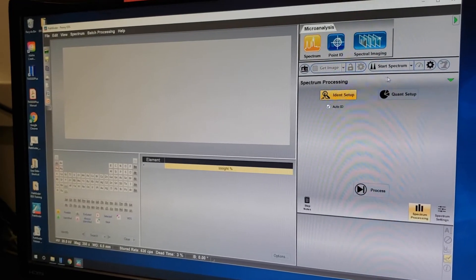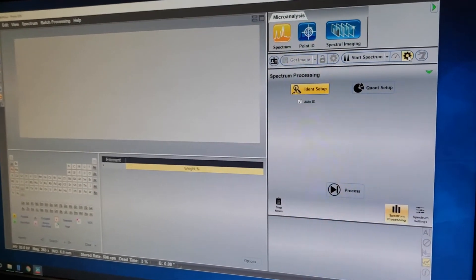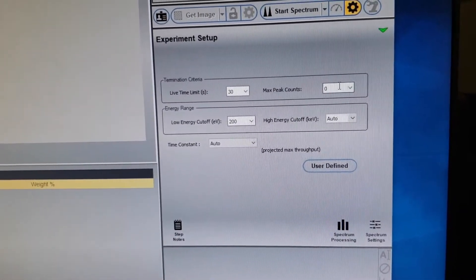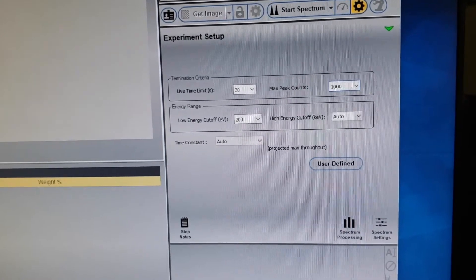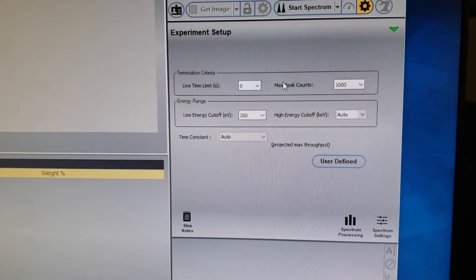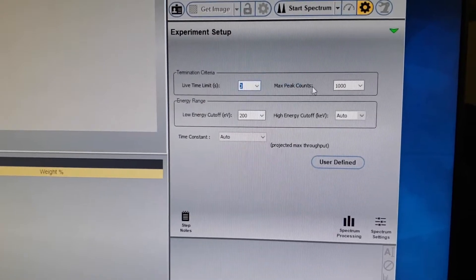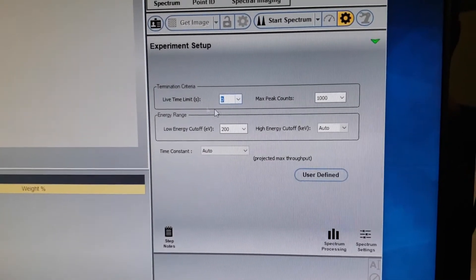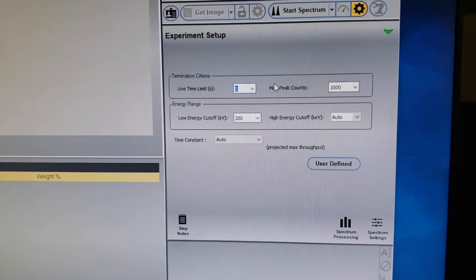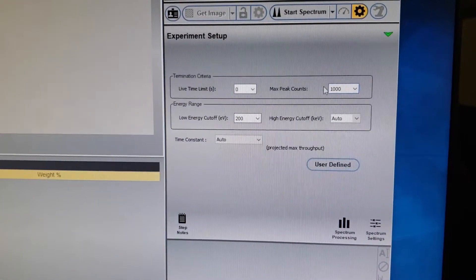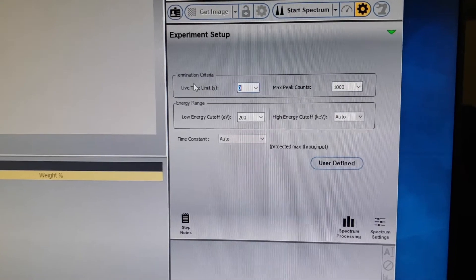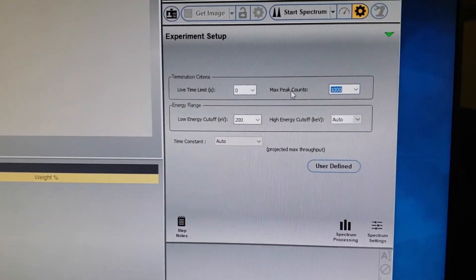For Spectrum, start by clicking on Spectrum, then click the gear to set criteria. The termination criteria determines how long it runs. I like to have it run until the upper peak is 1000 counts tall, and I typically set lifetime limit to zero. If you have values in both boxes, it stops at whichever happens first. You can also have all of them collect for 60 seconds and set max peak counts to zero.